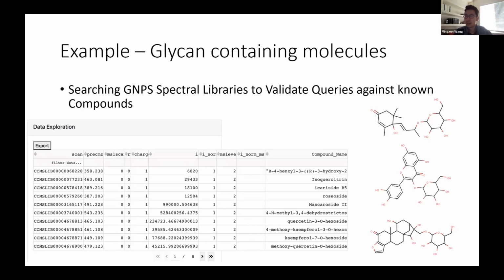And so we've done this for looking at some flame retardants, so organophosphate esters, and we've discovered some new flame retardant of that particular class that hadn't been characterized in literature before. With Allegro, we're looking for siderophores against public data, and so we're putatively finding some new ones. We're also looking for all bile acids that we can find and looking for new family members, and we're seeing quite a few of these.